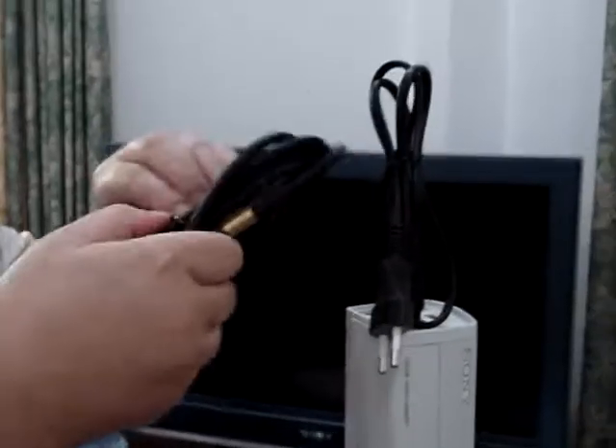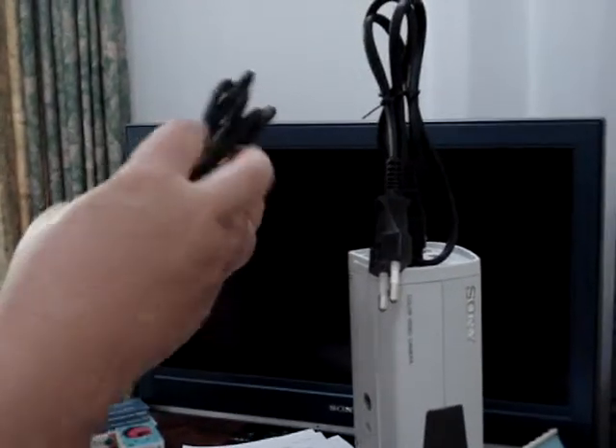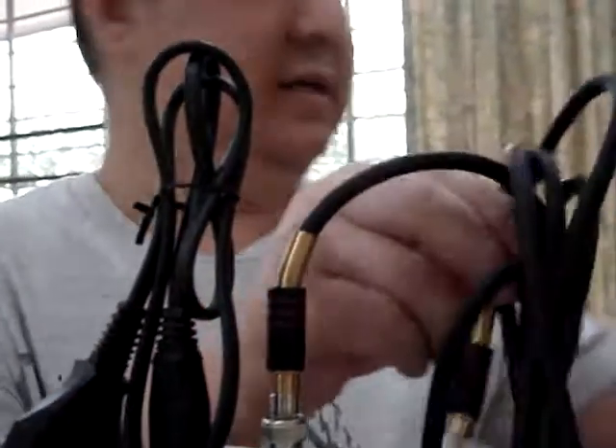Put the power cord and put the signal cord. Use this one to connect to the camera. Lock it. On the other side, use A/B channel for this one.